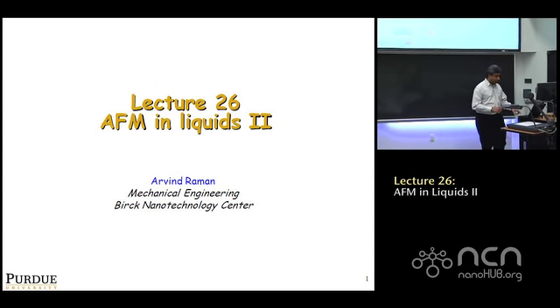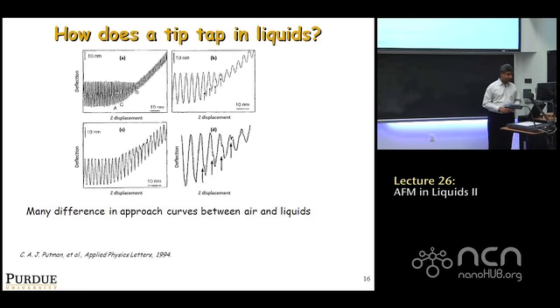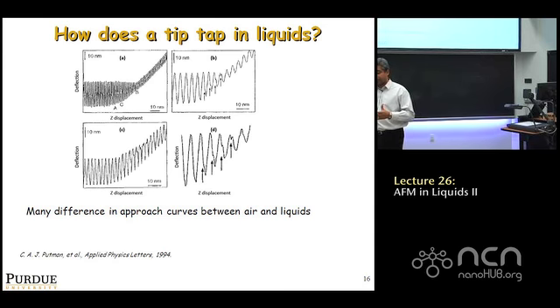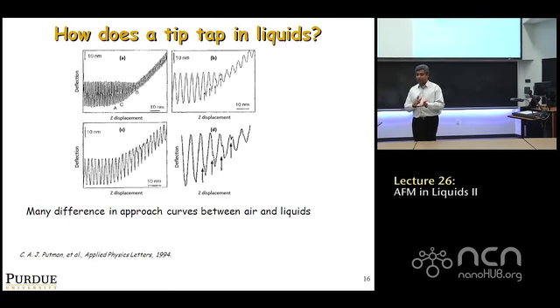What we need to continue on is to go a little more in detail about what happens in liquids when the oscillating cantilever actually interacts with the sample. This is a little more technical, a little more detailed, but hopefully you see some implications of it. Then we'll try to end with a discussion of new imaging modes and so on.